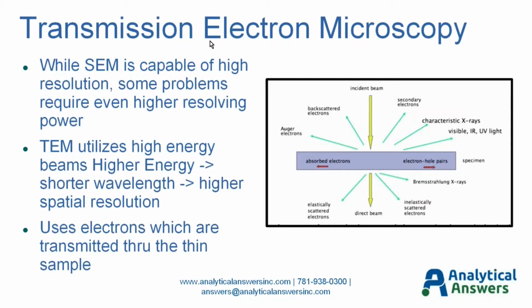What I'd like to turn to now is actual transmission electron microscopy, since we're dealing with thin samples. Now, rather than a scanning experiment, we're going to do a transmission microscopy analysis. This is the same diagram I showed you earlier, but now in the case of thin samples, we have the ability to directly transmit the beam through, and we have some other signals that we can use for analysis.